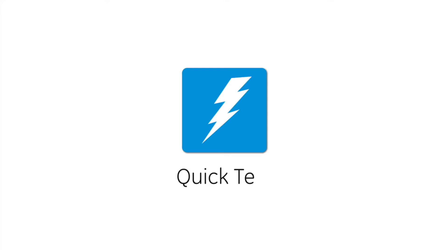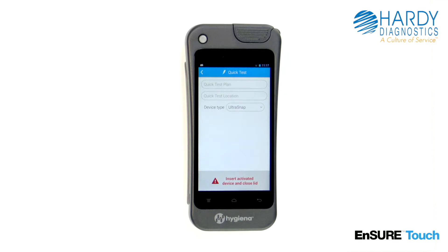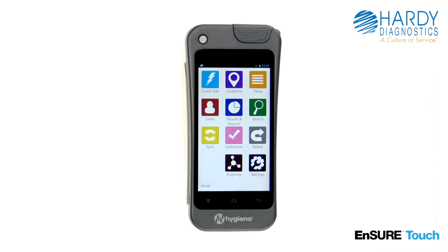Welcome to Hygiena's instructional video on running a quick test on the Ensure Touch. Quick test is perfect for testing on the fly outside of normal testing plans. We recommend filling out all the fields so that you can track the plan and location name of the test. However, this is optional. Let's get started.